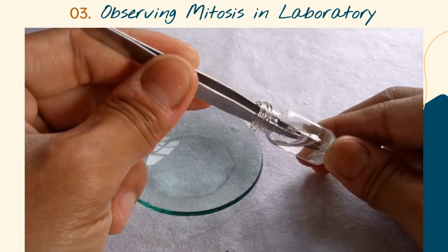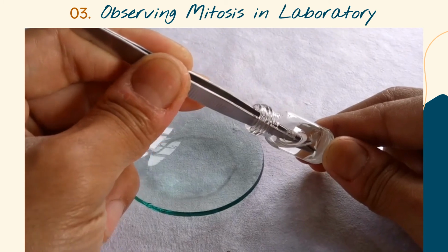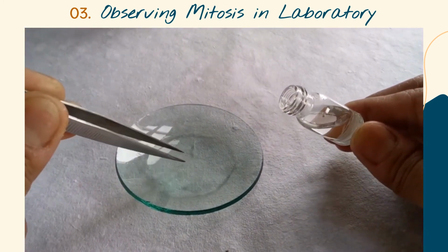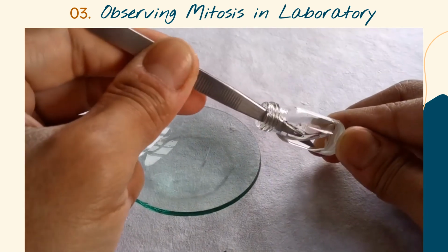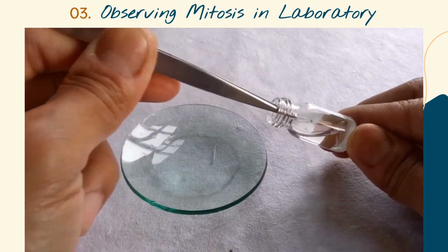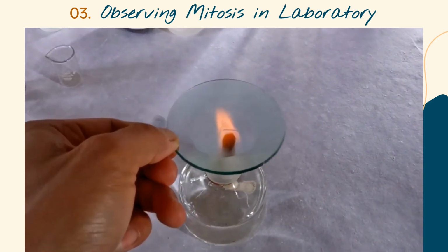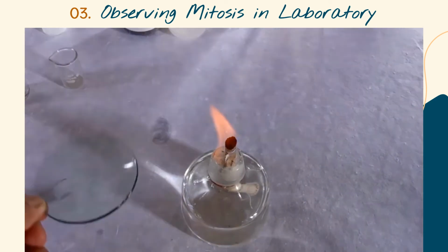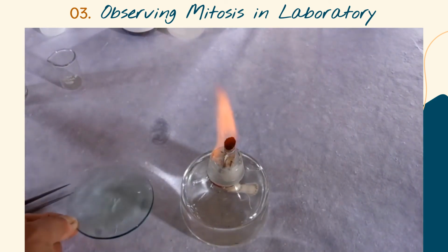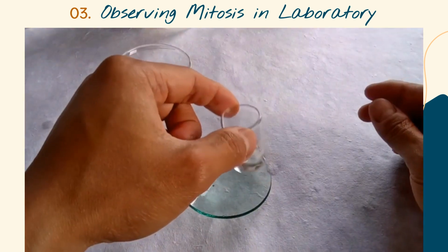Either way, take a few root tips from Carnoy's fluid or ethanol and transfer them onto a watch glass containing 1 normal hydrochloric acid. Acid will soften the cell walls and weaken cellular connections so it becomes easy to squash the root material later. Gently warm the watch glass on a flame for about 5 seconds. Expose the root tips in the acid for about 2 minutes. Give the root tips a couple of washings in distilled water.